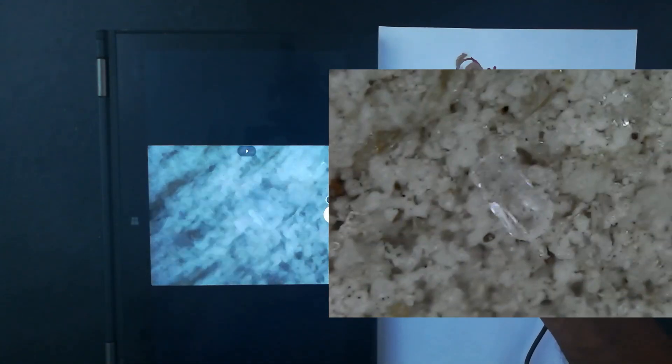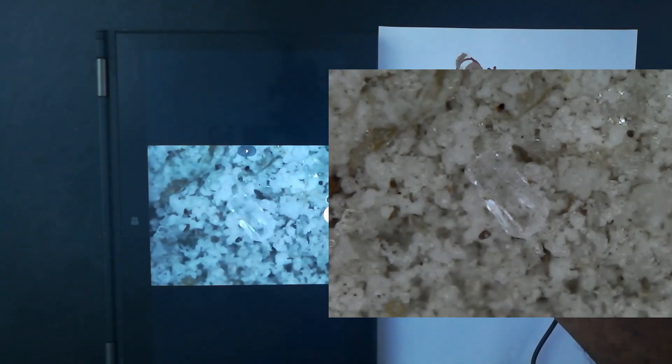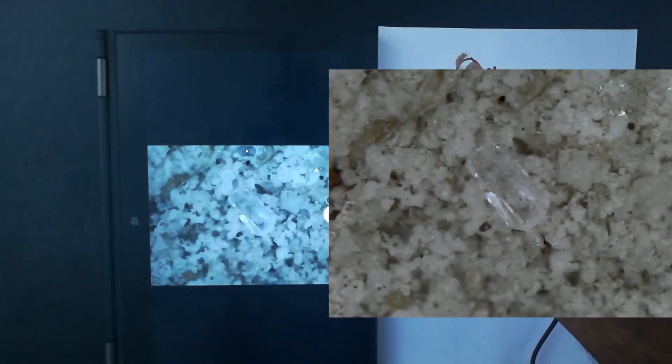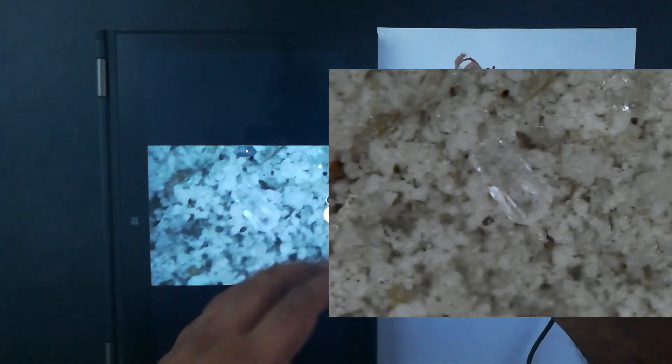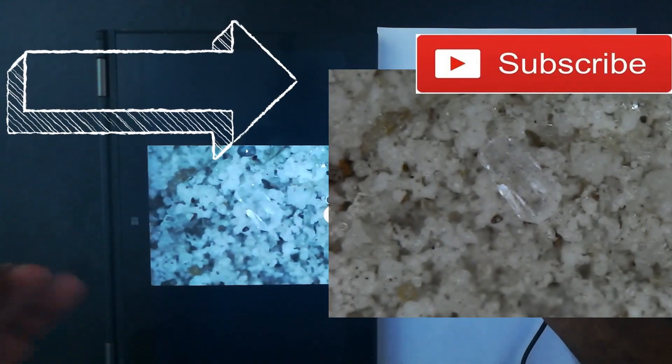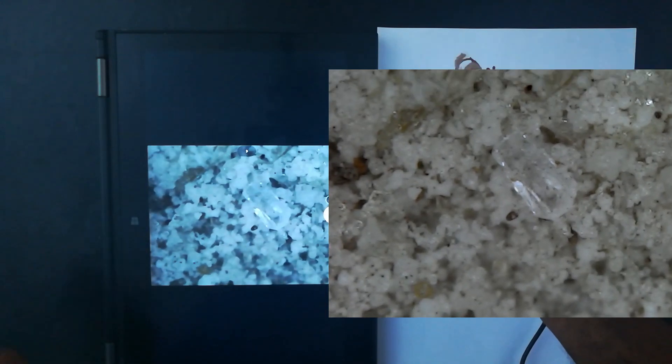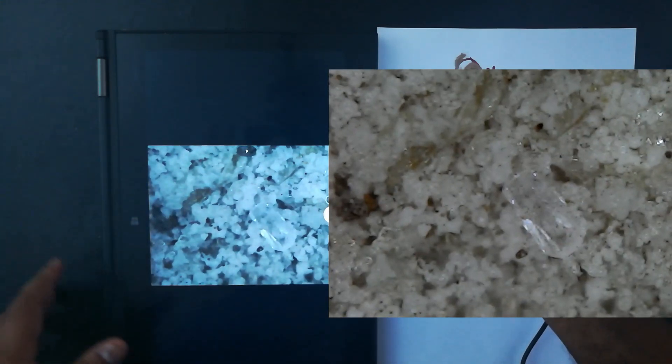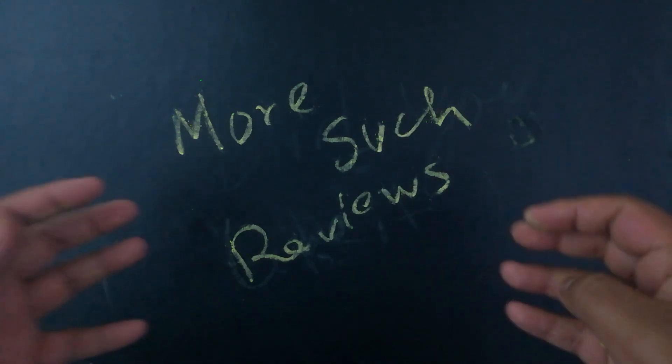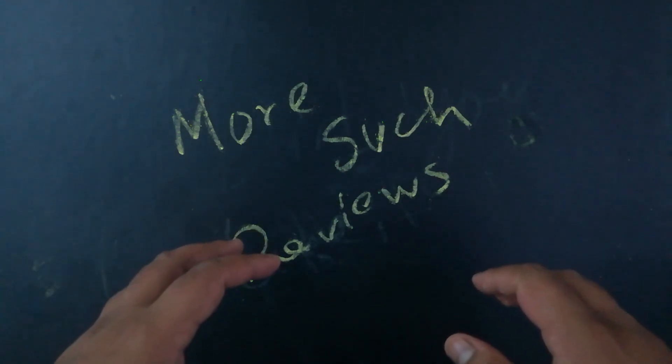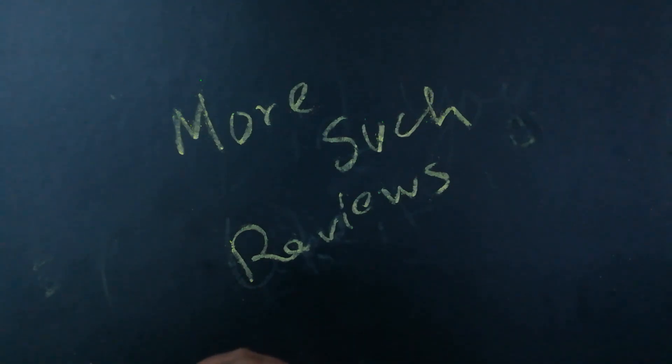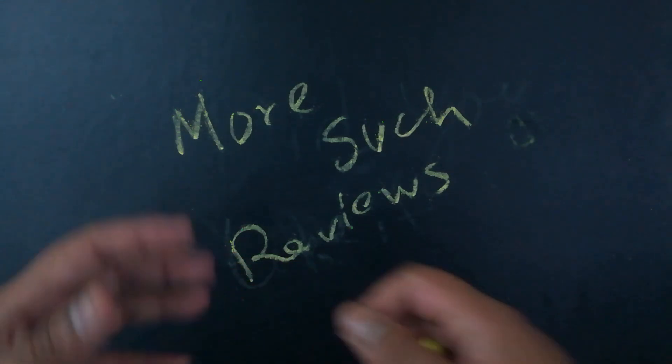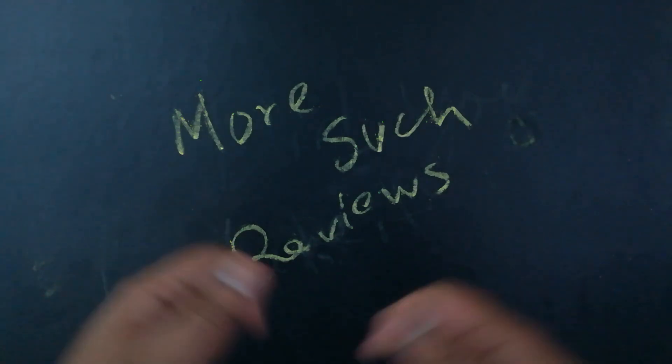So I don't know. I'll try to gather more info about it and maybe make a different video. If anyone has any more info about this, please let me know. But under the microscope, all these proteins from India, they're having some sort of crystal stuff in there. What I got to do, I think, is the next course of action is compare these with any of the brands coming from US. Mostly isolate or something. And see if they also have it. Then we'll get to know that something they're adding, they're all adding. Or maybe whey protein has that stuff. If you really want more of this type of review, because I'm going to bring a lot more of these comparison videos under the microscope. And we get to know what all things these people put in the products that we consume. But let me know what your view is. Do you think it's useful? Please let me know. And that encourages me beyond anything. And I'll be pumped to make more videos like this. Until next time, have an awesome life, folks. Ciao.